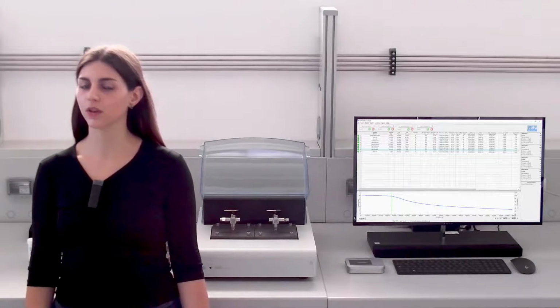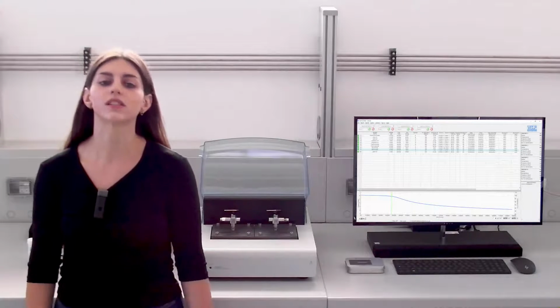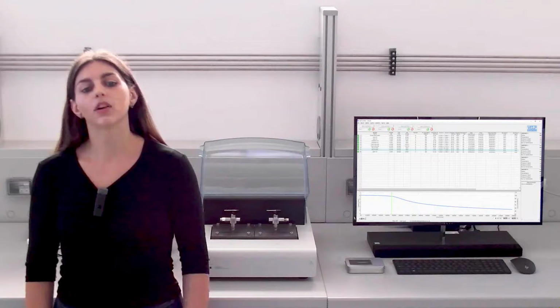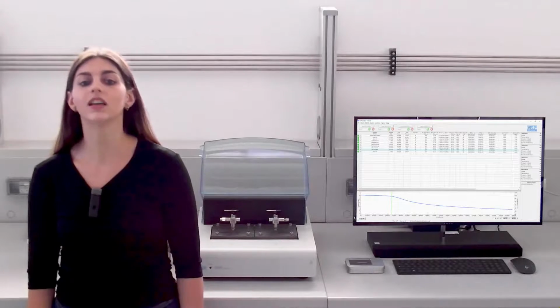I'd like to further discuss a couple of topics with you. So, first of all, oxidative stability of bakery products by Oxitest and sensory analysis. Your results show that it is critical to perform dedicated analysis to predict the correct shelf life. I'd like to explore your point of view about this. Would you suggest to every producer to do so, or is the estimation in some cases just enough?